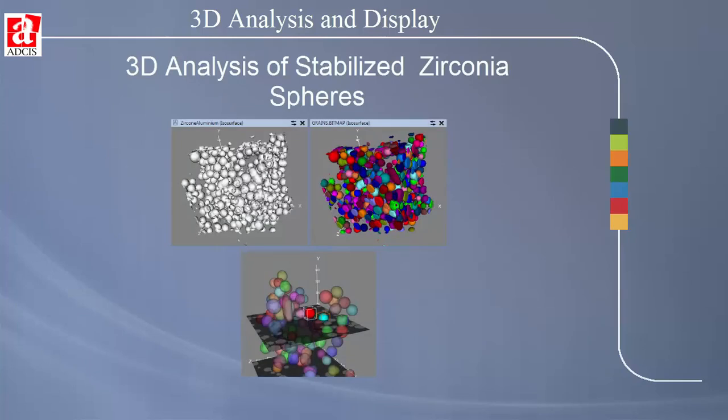Here is an example of how the Aphelion Imaging Software Suite can be used to characterize a 3D image. This is an image of stabilized zirconia spheres. Although the spheres are touching one another, they will be separated so that volume, surface area, sphericity, and nearest neighbor count can be measured.